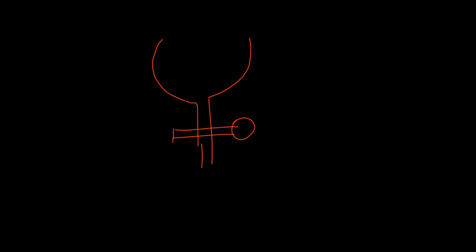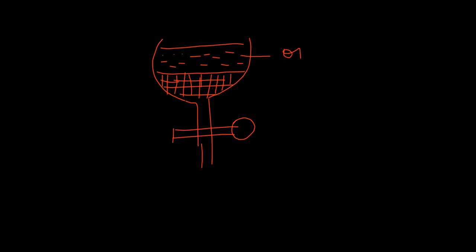I'll pour the mixture into this funnel. So I'll pour it here. So you would have two layers. The first layer will be the water. It settles first because it has a higher density. Then we have the next level, which will be the oil. Remember, the tap is closed at this point. We have the oil, we have the water.